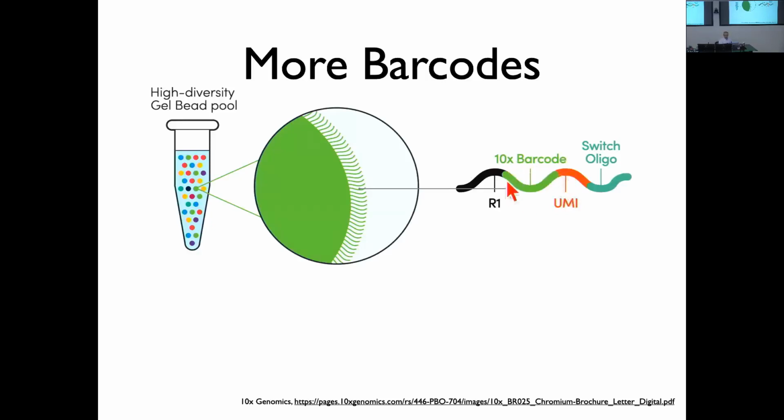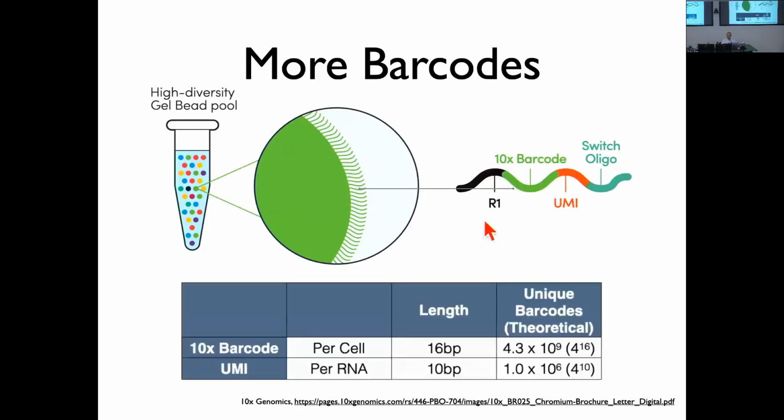So this is actually really simple, and it has a little bit to do with what we talked about for the basic intro to high throughput sequencing, how that works. So you take a bunch of beads that don't have any oligos on them. It's easy to get the R1s all the same, right? Because that needs to be identical across all the beads. So let's say you've got the R1s already made, so you got this bit made. Now you want to make the 10x barcode, and you want all the oligos on the beads to be the same.